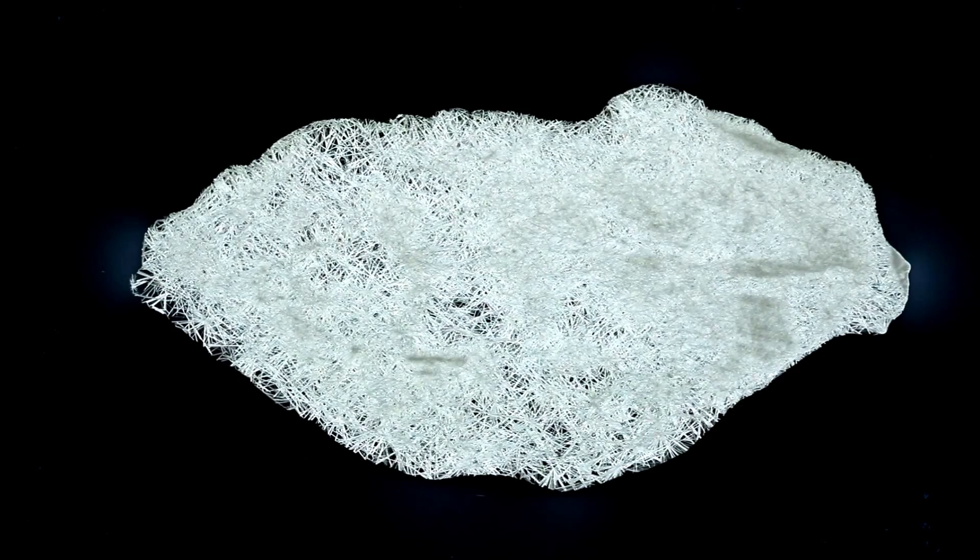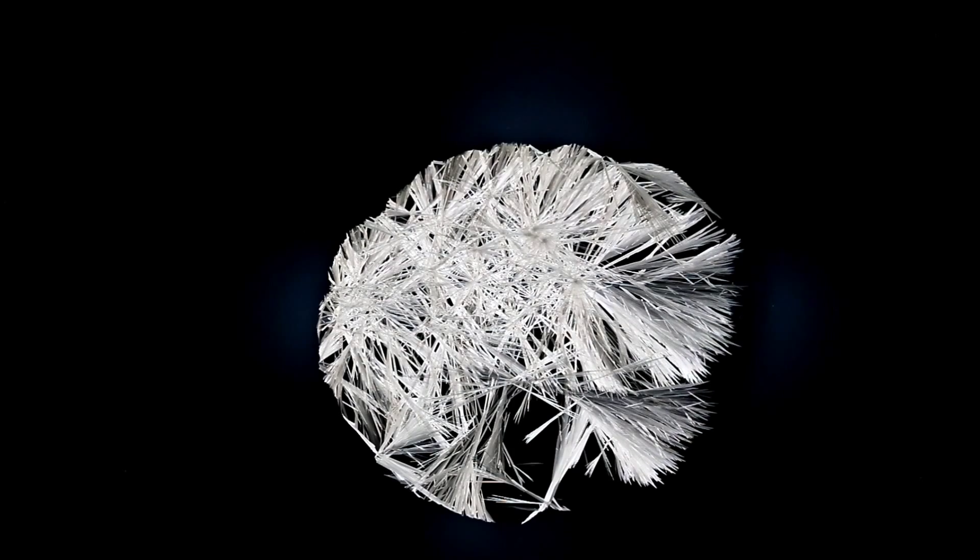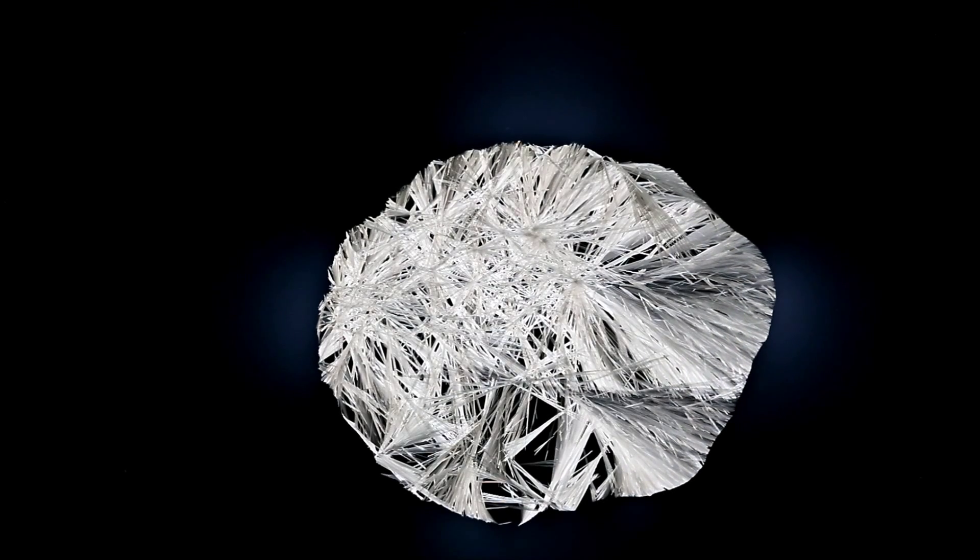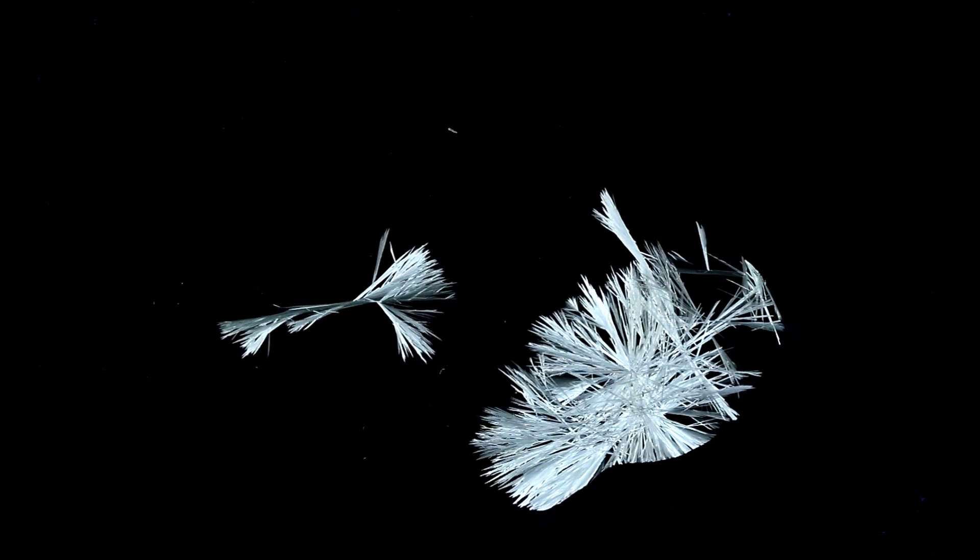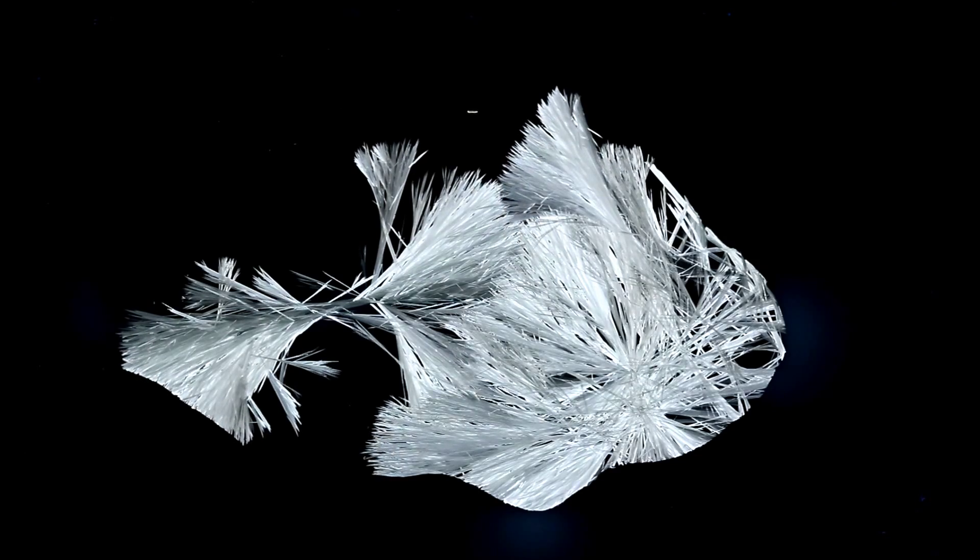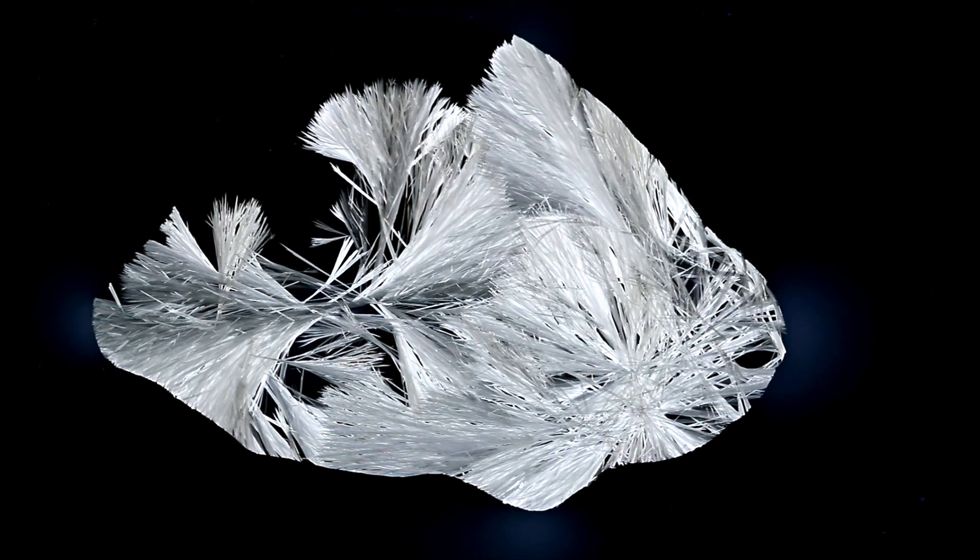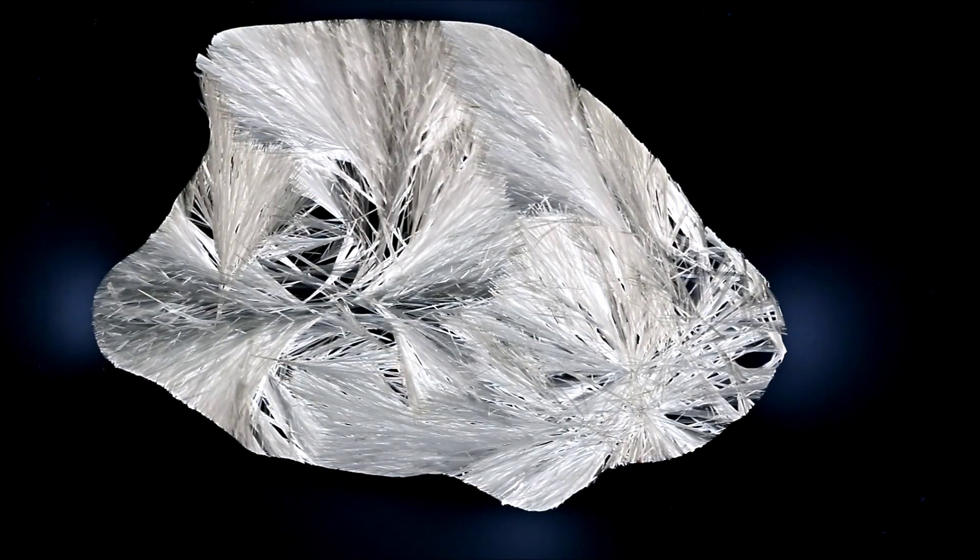For example, here just pouring some solution out on a glass plate caused the crystals to start forming. This can even happen to lower concentration mixtures. For example, here's a 2:1 which also triggered when I poured it out. Spontaneous crystal development like this may be valuable if the goal is to show how unstable the crystal-growing solution can be. To avoid this, I prepare my samples ahead in covered petri dishes and then trigger them with seed crystals dropped in when I want the crystals to start forming. Let's watch a couple more.